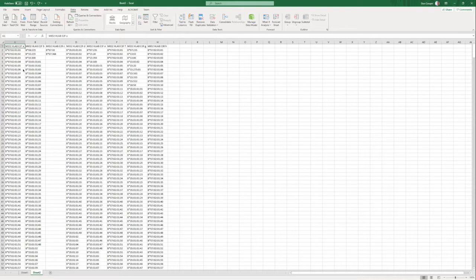We need to combine all of those because the true alleles will not only match the consensus sequence for exon 2 forward, but they'll also match one of the consensus sequences for exon 2 reverse, and one of the consensus sequences for exon 3 forward, and one of the sequences for exon 3 reverse. Any allele which does not have a match across all 4 is obviously not the true allele, because we have 4 parts of sequence and you have to match all of those in order to be the allele which was present.